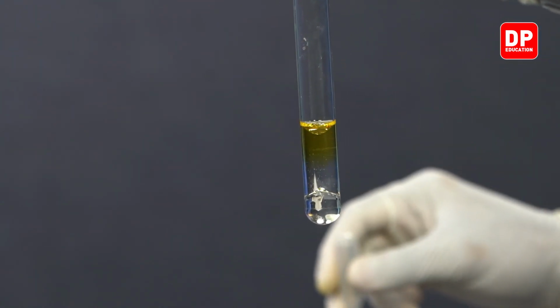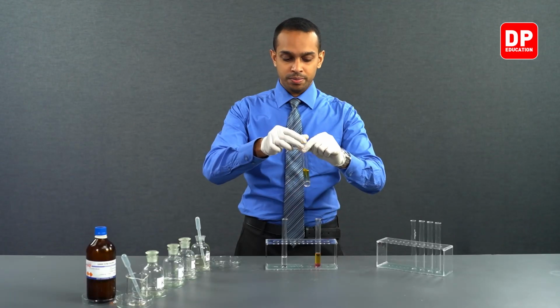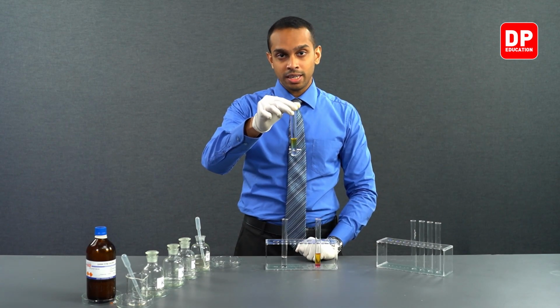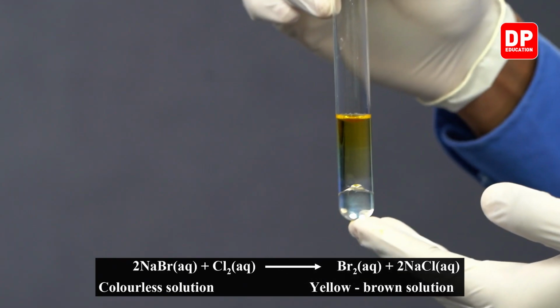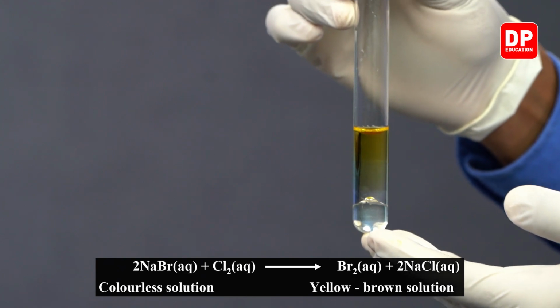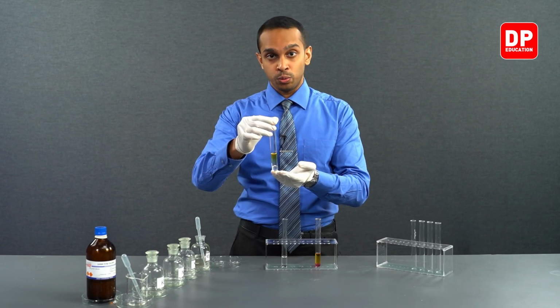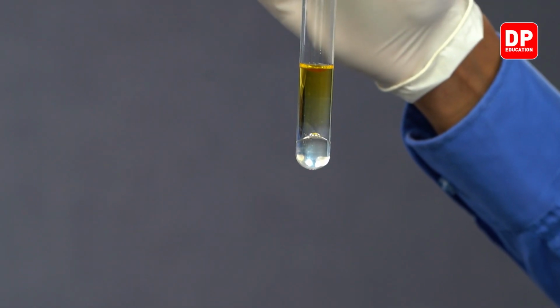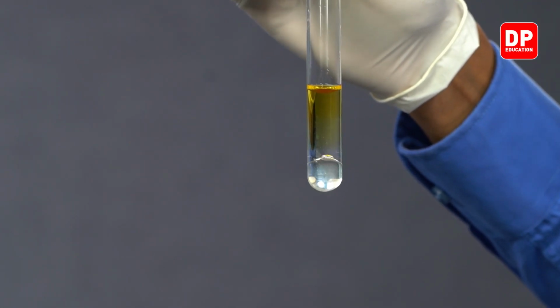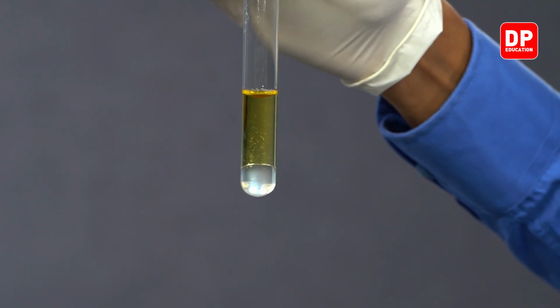Now you can see, as soon as I add a little bit of chlorine water, the color of the top layer starts to change. This is due to the fact that when you add chlorine water, the bromide ions present in the medium get displaced as bromine, or in other words, Br minus gets oxidized to Br2. Br2 in aqueous medium normally gives off a yellow-brown color, or in this case, it appears a little orange. So this orange color is present in the top layer.